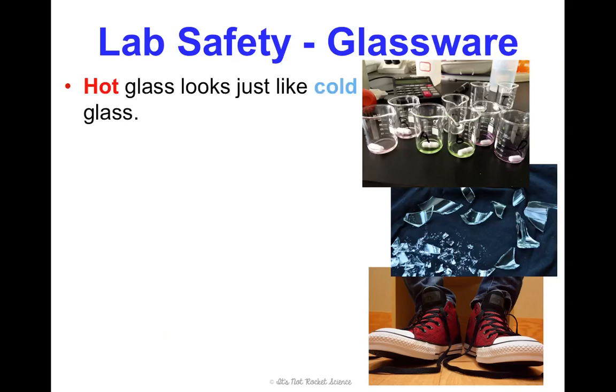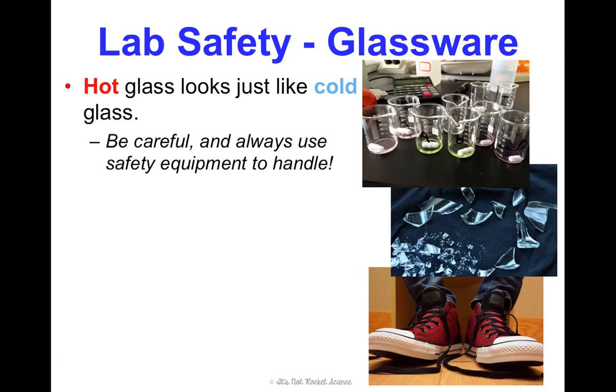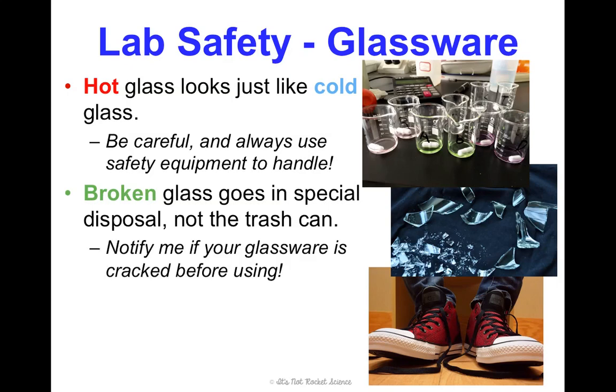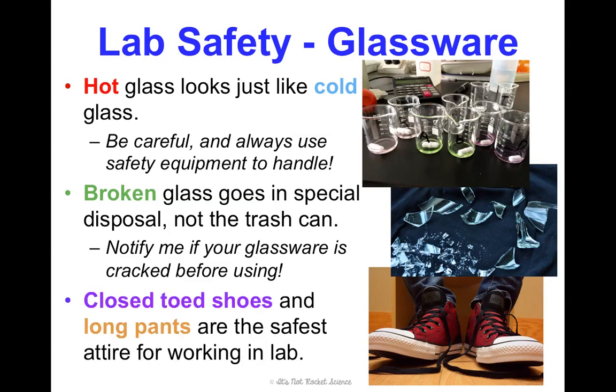When using glassware, one thing to note is that hot glass looks exactly like cold glass, so never assume something is room temperature — always use protective equipment when working with heat. If glass is broken, it has a special disposal — not the trash can — because shards will rip the bag and create a big mess. If glassware is cracked, let me know before using it, because heating or using chemicals with it could cause it to shatter. It's also preferred that you wear closed-toed shoes and long pants when working in lab to protect yourself from broken glassware and chemical spills.